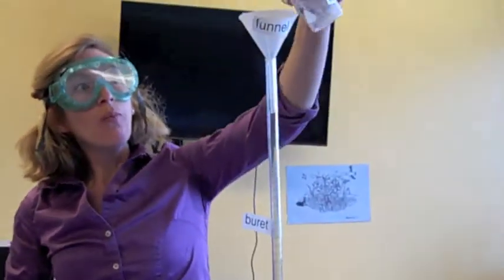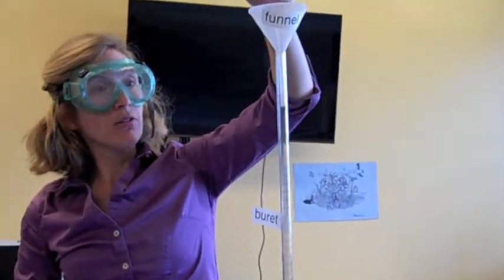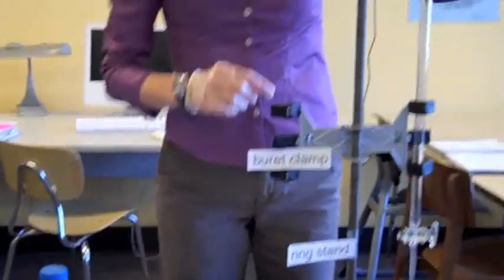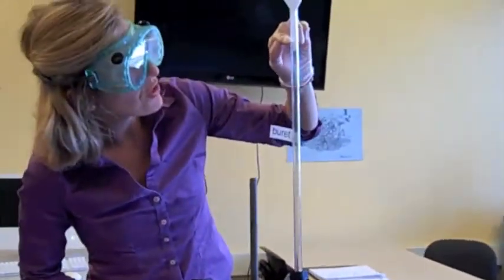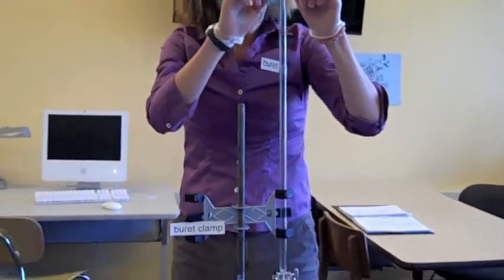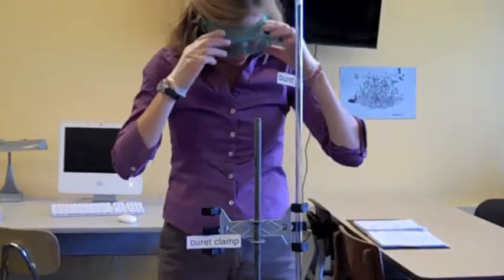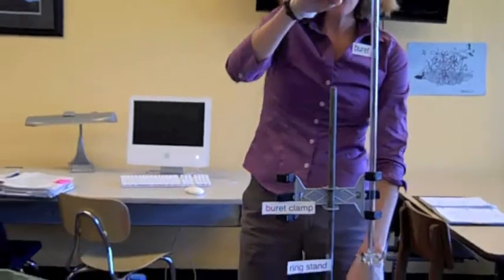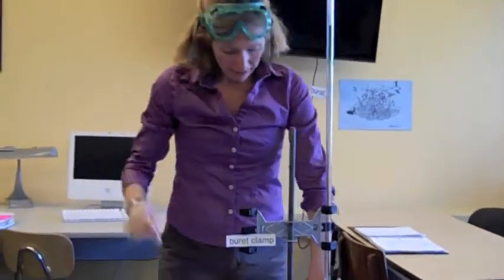Then when you've got your hydrochloric acid in your beaker, pour it into this funnel carefully. Don't get it on your skin. That would hurt too. And it should be just about to this top gray line. This is 50 mils from here to here. Mils is short for milliliters. Okay, next step. Record where you are here. Write that down.